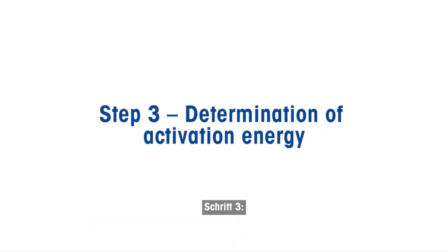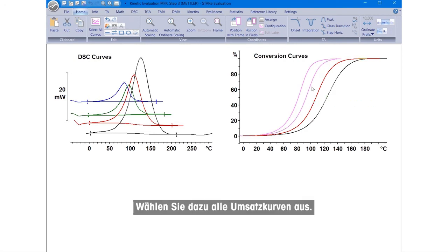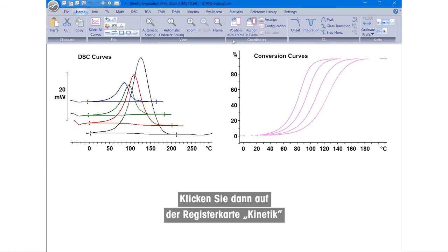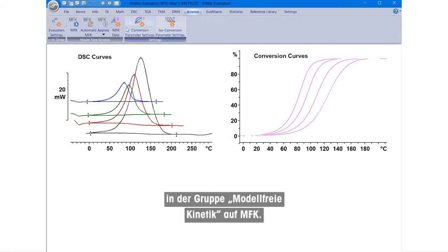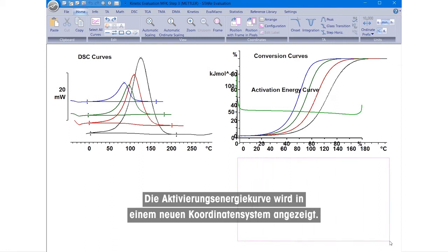Step 3. Next, we would like to obtain the activation energy curve as a function of conversion. To do this, select all the conversion curves and under the Kinetics tab, click on MFK in the Model Free Kinetics group. The activation energy curve is displayed in a new coordinate system.